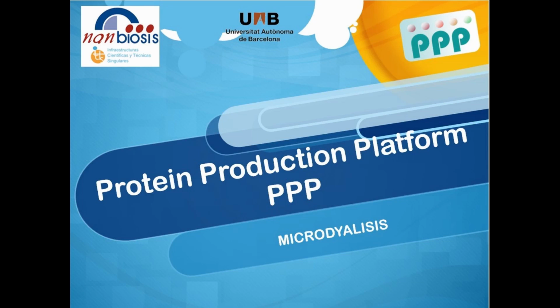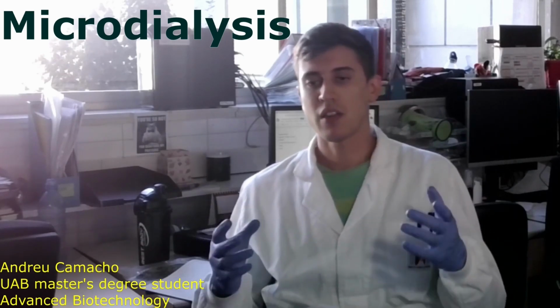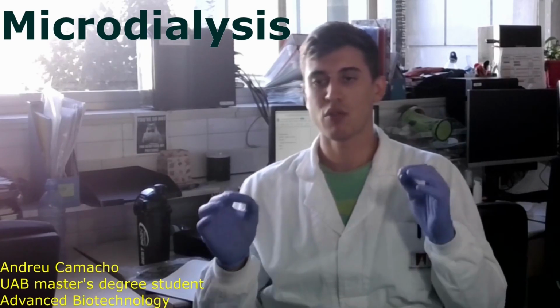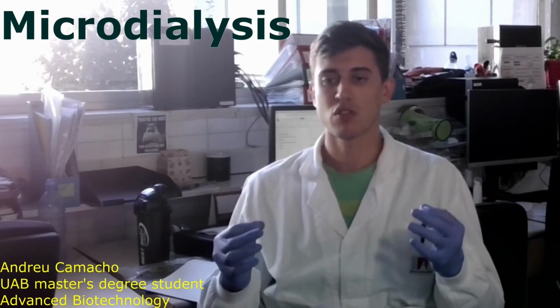Microdialysis. The objective of this method is to screen different dialysis buffers once your protein is purified. The idea is to put in contact a small part of your sample with the buffers through a filter membrane to easily see if your protein precipitates. Then you can choose the buffer in which your protein is soluble.